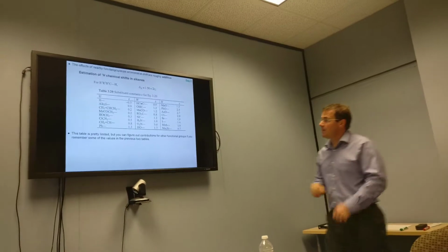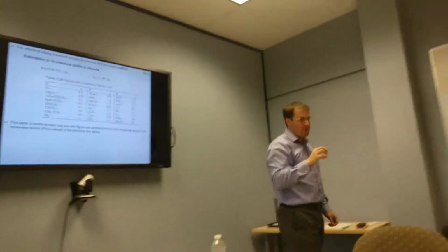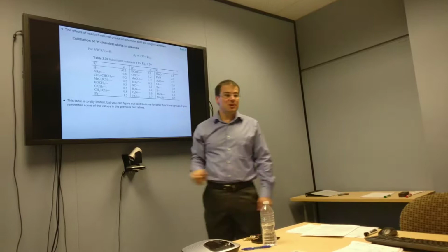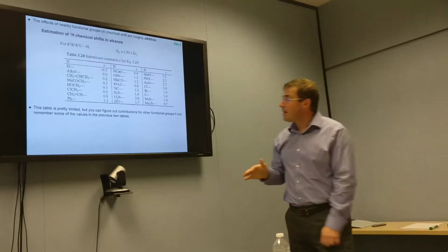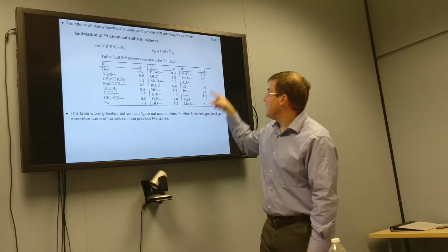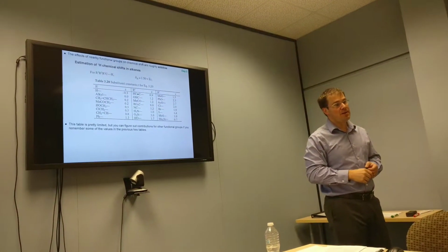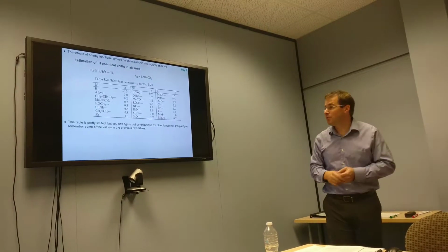You'll find this additivity table, which tells you that if you start with any particular CH, and we'll give your default CH a chemical shift of about 1.5 parts per million, and you add any functional group, you should be able to add approximately this amount of chemical shift value and get to a sum that is approximately going to be the chemical shift for your observed proton.